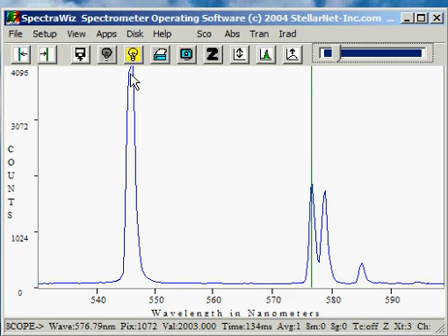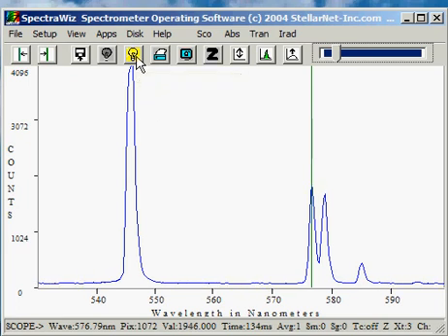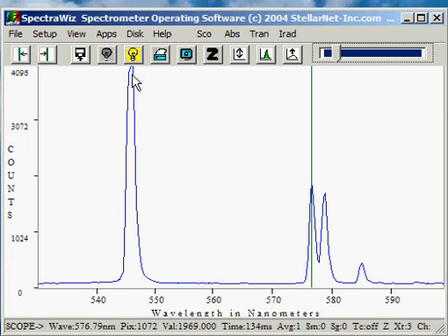The yellow lightbulb allows you to save a reference spectrum. This is normally done when you're setting up for the absorption, transmission, or reflectance modes.